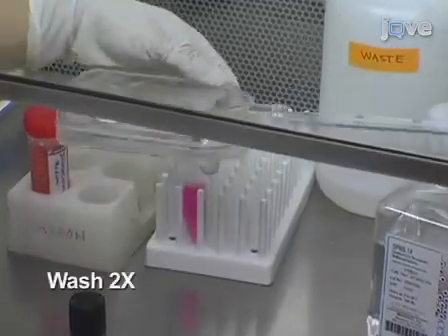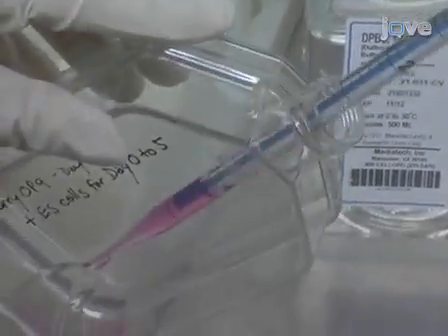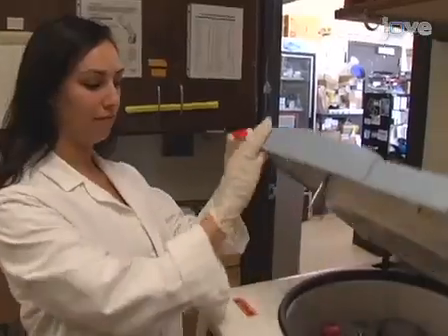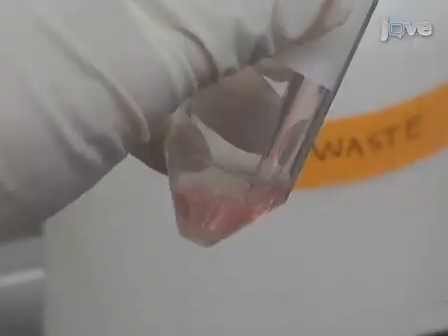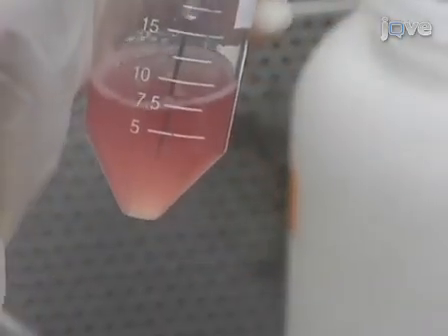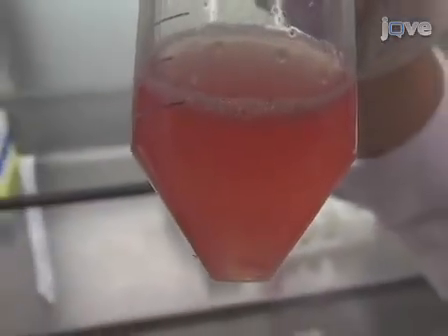Carefully wash the co-culture 2 times with PBS and trypsinize cells with 0.25% trypsin EDTA. Wash cells off flask with ES differentiation media and transfer to a tube. Pellet cells at 400 G for 7 minutes at room temperature. After centrifugation, remove the supernatant and add new media. Then use a 21-gauge blunt-ended needle to resuspend cells and to ensure a single-cell suspension.